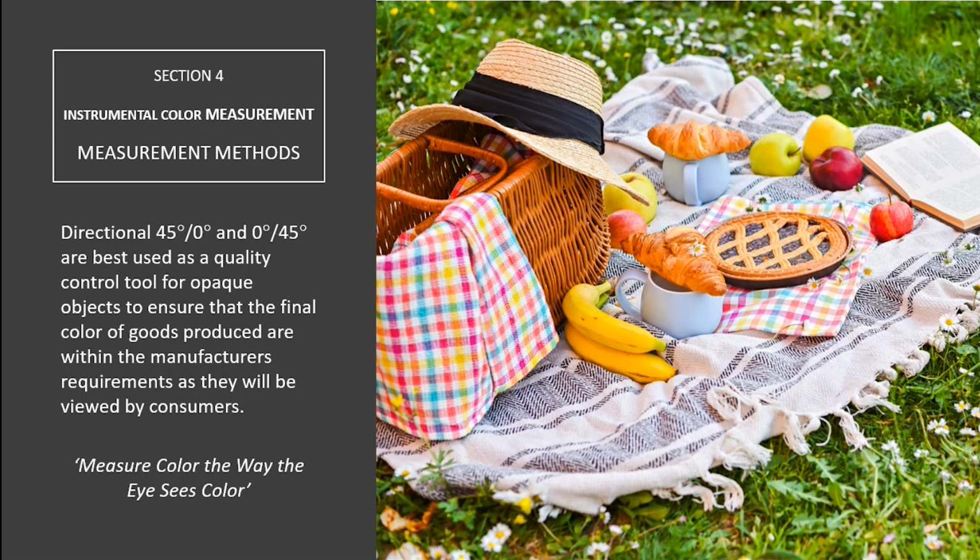This is important when we want to make sure the color of the product or its labels that we put on the shelf meets what we expect the consumer to see from a color standpoint.